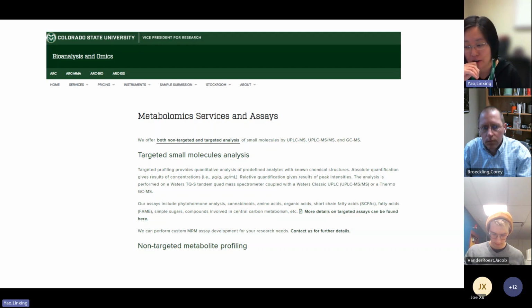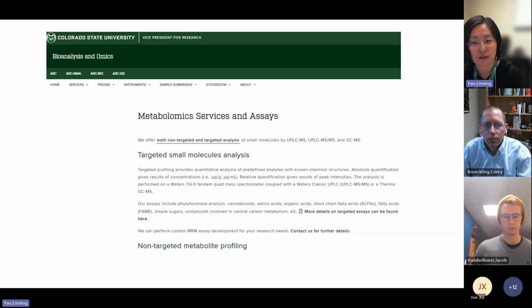And if you're craving the highest sensitivity, triple quad is usually better than a TOF instrument, at least at the current level of instrument configuration. The other advantage with triple quads is that both TOF and triple quad can run MRM experiments, but with a triple quad you can include something like 100 compounds within one method.